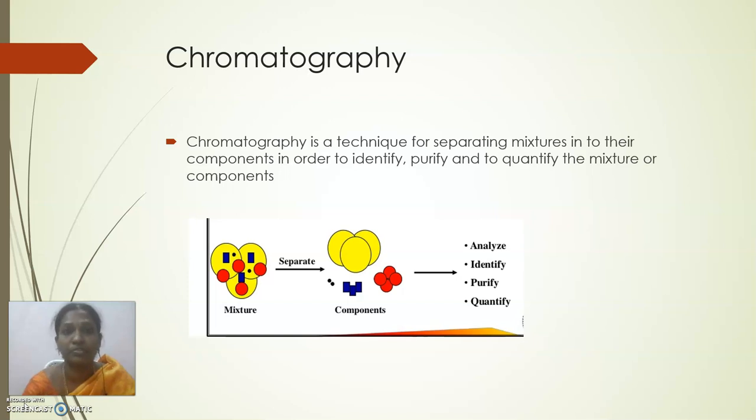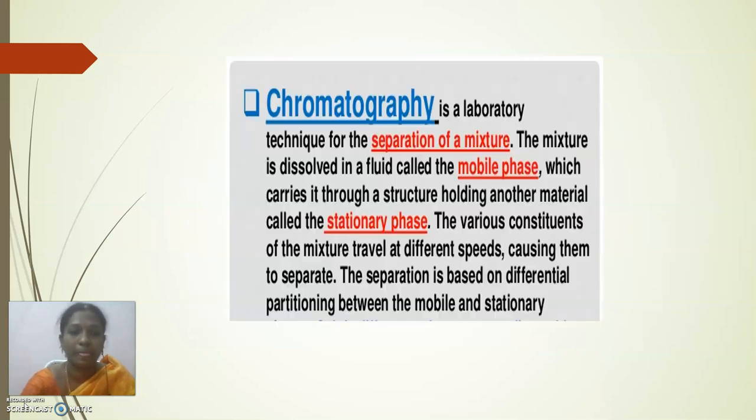What is the purpose of doing chromatography? It helps to analyze the components, identify them, purify them, and quantify them.